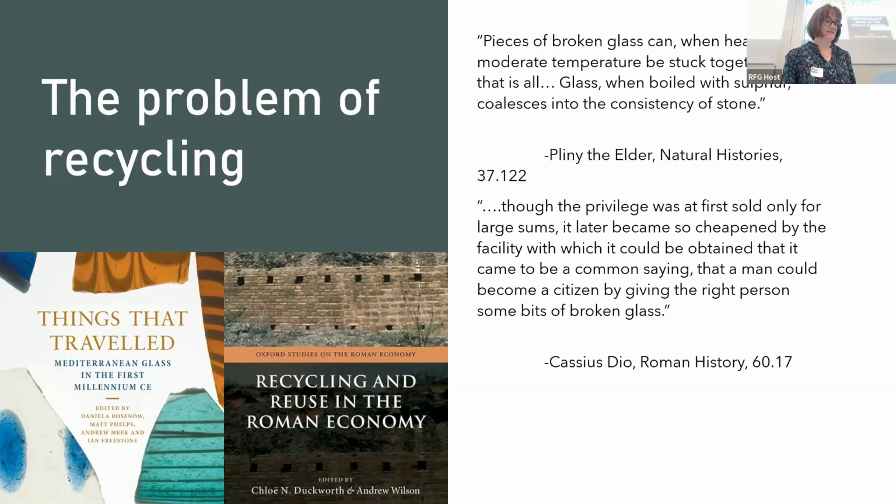The mixing of a number of different glass vessels via the recycling process can lead to complex geochemical profiles, but the presence of a number of elements in the glass can be used as a simple identifier of Romano-British glass material. Antimony, for example, is not present in quartz or any of the other components of glass in any significant concentration, but there is a significant amount of antimony being added to recycled glass as both an opacifier and a decolorant. Whilst this could be seen as a simplistic silver bullet for the identification of antimony, the concentration of antimony is often highly variable, which means that there's a high possibility that the glass that has been recycled is not detected by materials analysis due to the calibration of the equipment used.